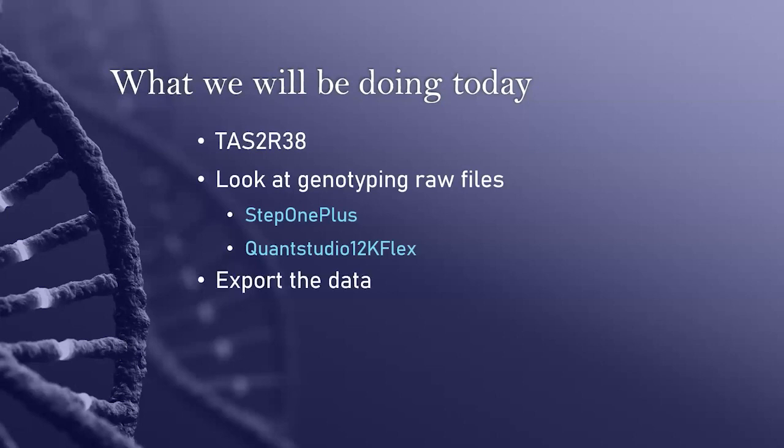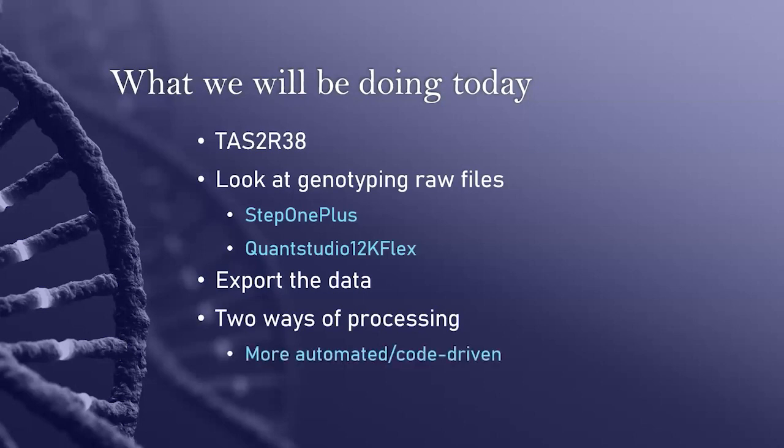We'll investigate the files that come out of those softwares, and we'll go through the process of exporting and what the raw files look like when they're on the machine software and afterwards. After we do that, we're going to examine the main methods of data analysis. There's one that is through RStudio and it's more automated, which is what I prefer. It's a code approach and focuses on making sure that it's an efficient and correct process, as opposed to some of the mistakes you can make when you're manually coding the data.